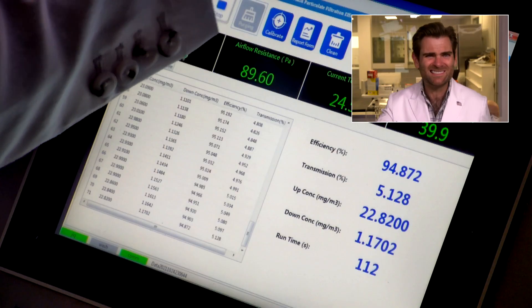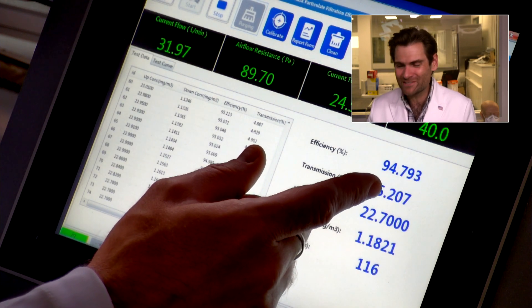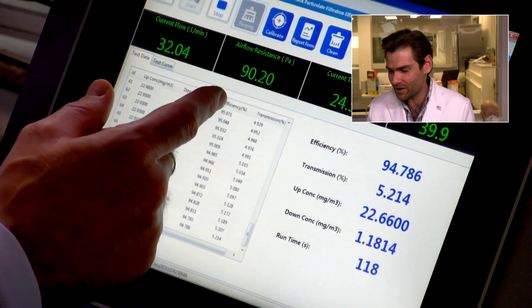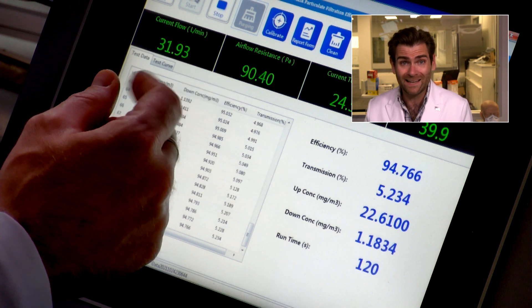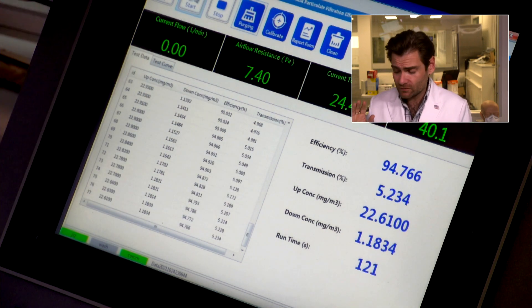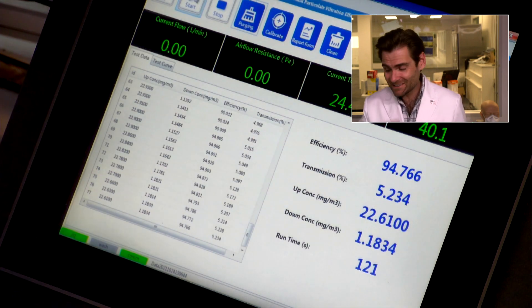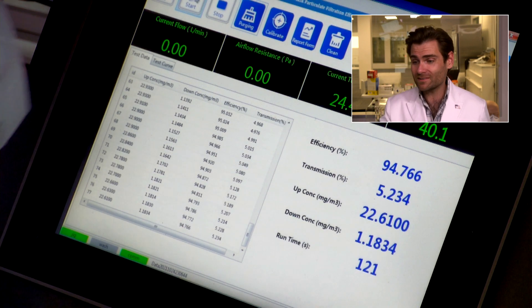I'm going to switch on over because we're so close — this is exciting. The standard is 95 percent... oh, we're just underneath it. Airflow resistance is beautiful: 90 pascals. I'd love to see that for a kids' mask — super breathable. They just missed the standard: 94.766 percent.